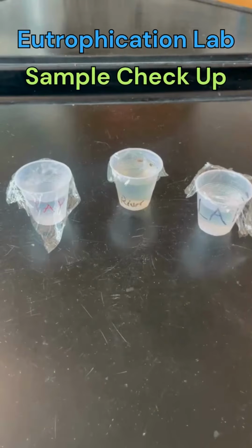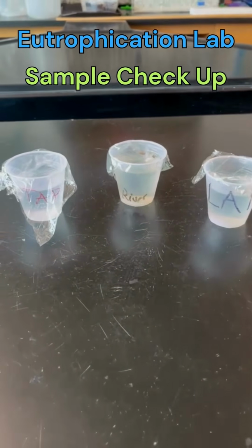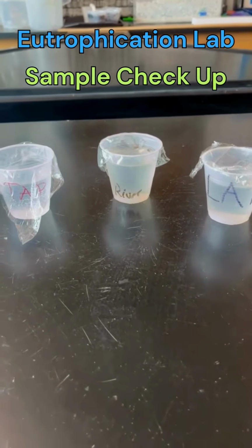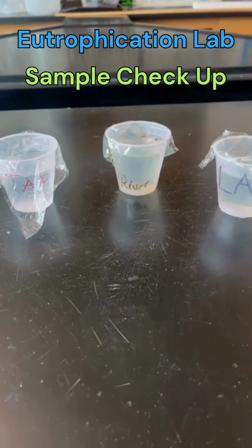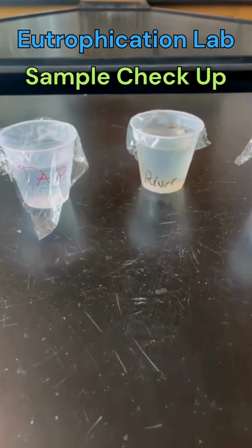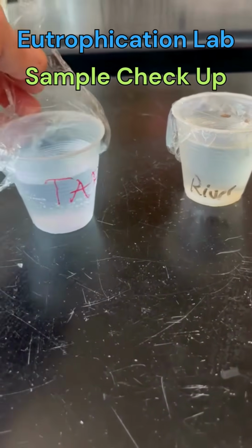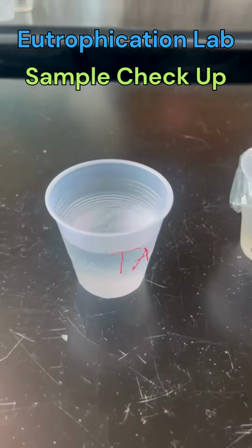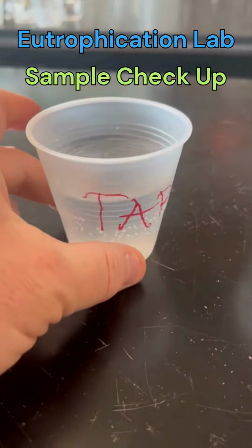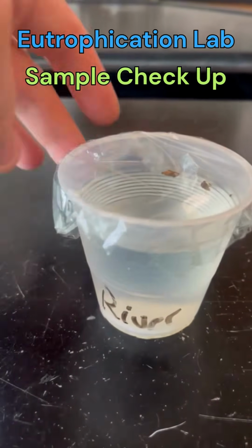Once I had set up the eutrophication lab, I put the samples on the windowsill to be exposed to the sunlight over about 7 to 8 days, and came back and analyzed the results or any changes that might have occurred in the 3 different samples. So in terms of the tap water, which was basically added with the nitrogen and phosphorus, there was very little change of color or any kind of sign of any algae growth or eutrophication.